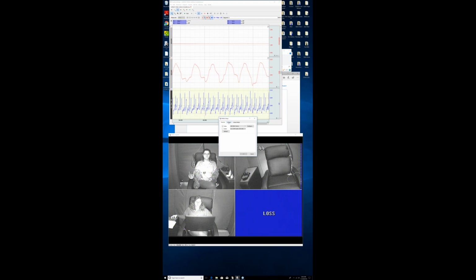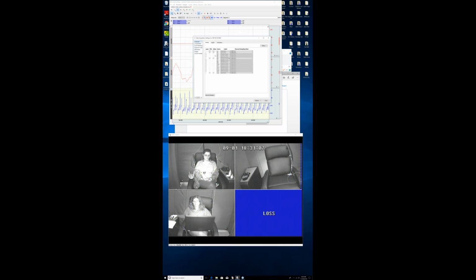We're outputting to this untitled ACQ video file, which is basically the same file name that I've got at the top here, untitled. I'm going to close that out. If I come into the MP160 menu, I've got this set up so that I'm recording electrodermal activity, ECG.